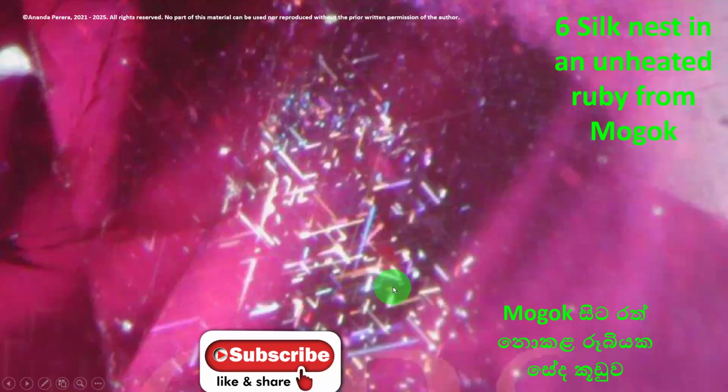It is solid. This is liquid and gas. See the difference. There are three phases in matter. Out of that, gas and liquid phase inclusions are here, and the solid inclusions are here.